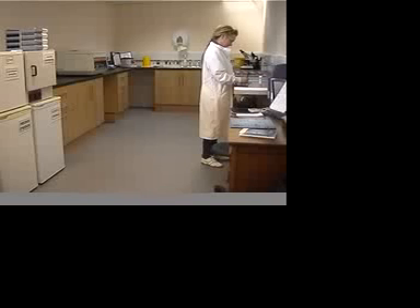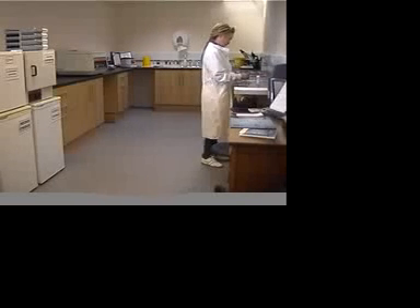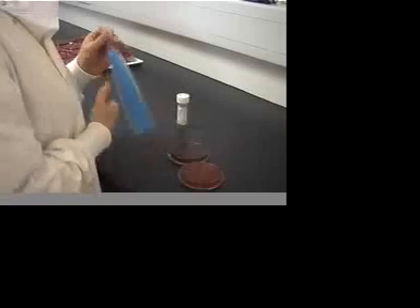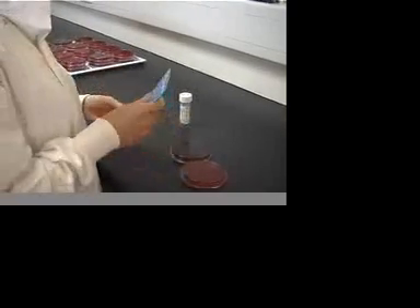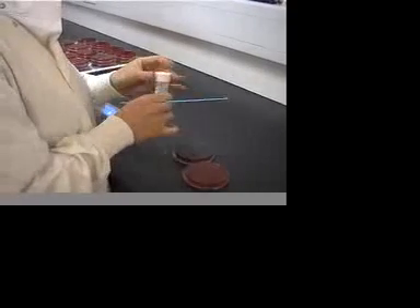Let's have a look at the laboratory processes. On receipt, a technician will streak the sample onto a sterile bacteriology plate. These are plastic dishes containing different gels in which different types of bacteria will grow to provide a visible change the following day.